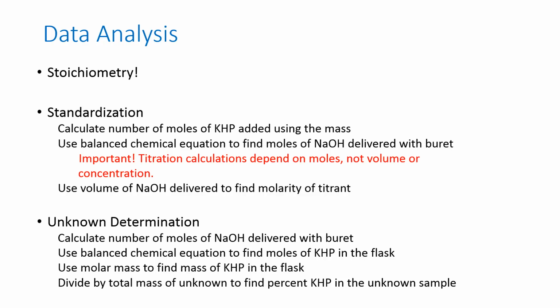Your accuracy grade is going to depend on how close that number that you report is to the true number specified by the manufacturer in their assay certificate.